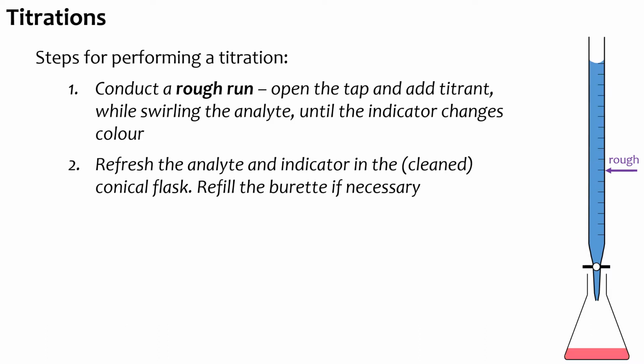So just going to do that. There we go. Filled the burette up and we've refreshed the analyte. We've got it back to being red again. Now that we've done that, we start to conduct our proper runs where we're being accurate.